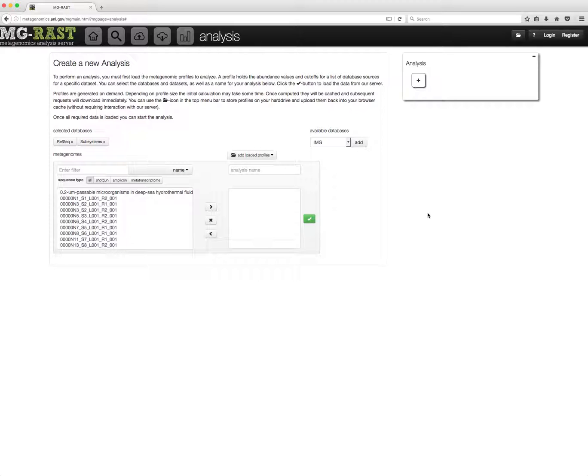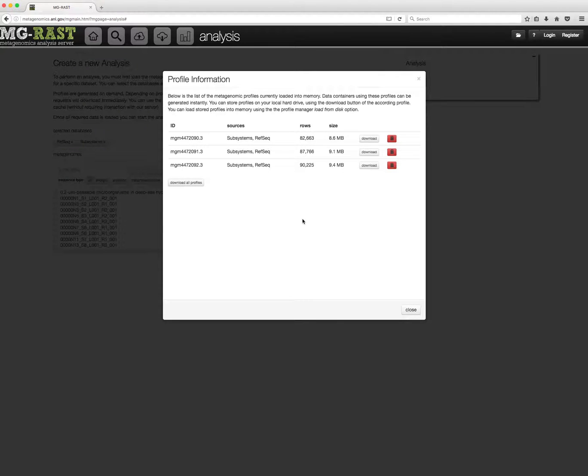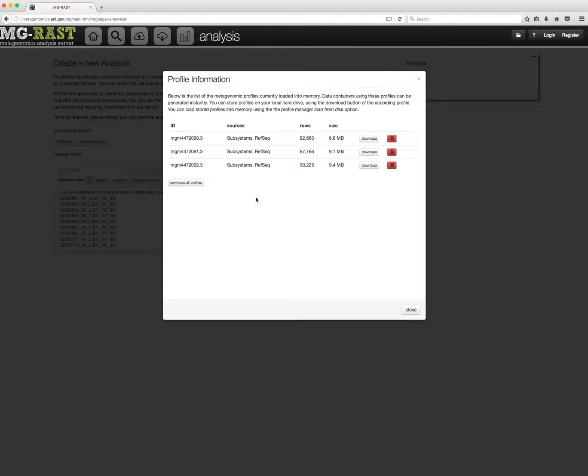Downloading profiles to disk is done via the folder icon, then clicking manage. You can download individual profiles or all of them at once. In either case, each profile will generate a separate file.